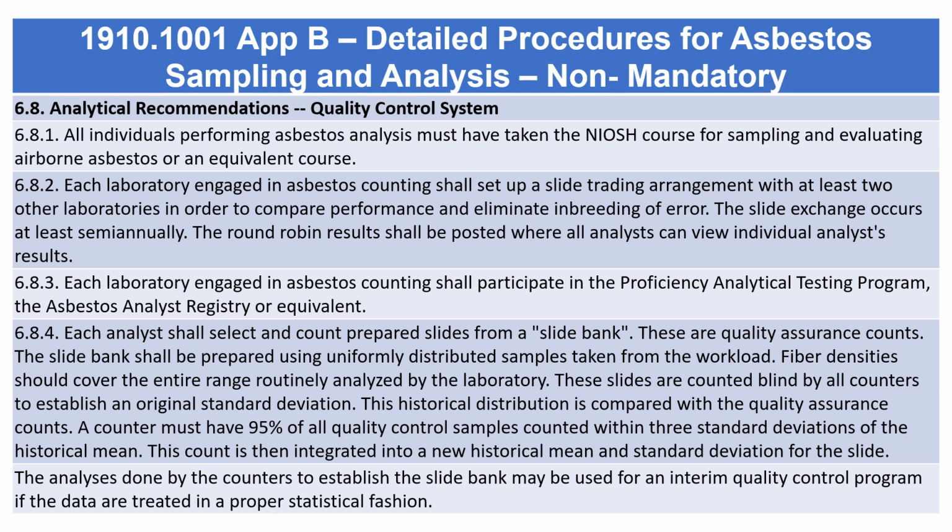6.8.3. Each laboratory engaged in asbestos counting shall participate in the Proficiency Analytical Testing Program, the Asbestos Analyst Registry or equivalent. 6.8.4. Each analyst shall select and count prepared slides from a slide bank. These are quality assurance counts.